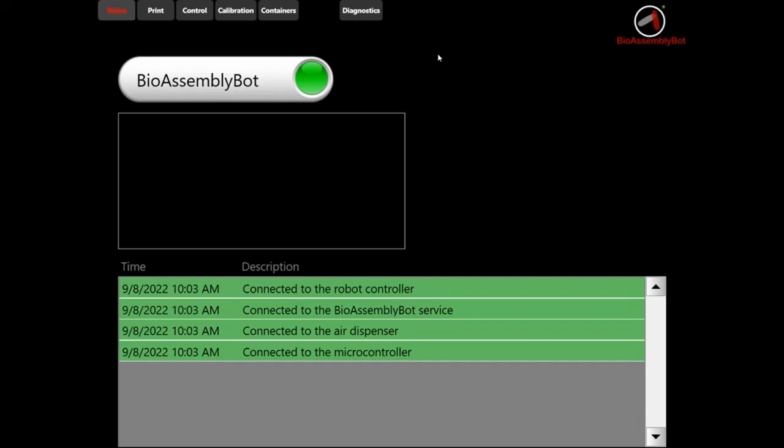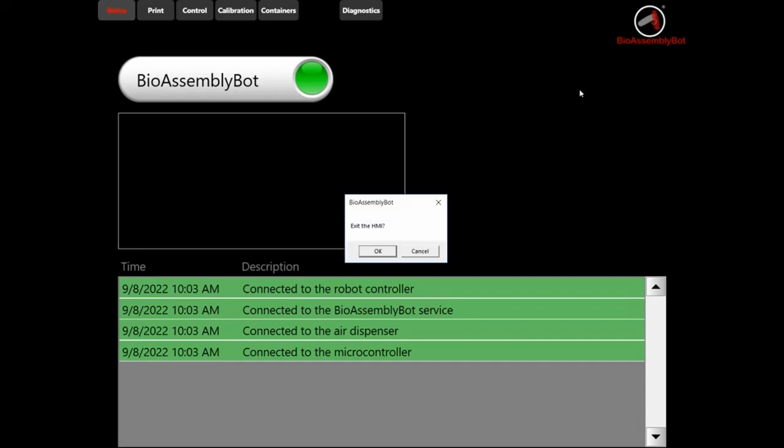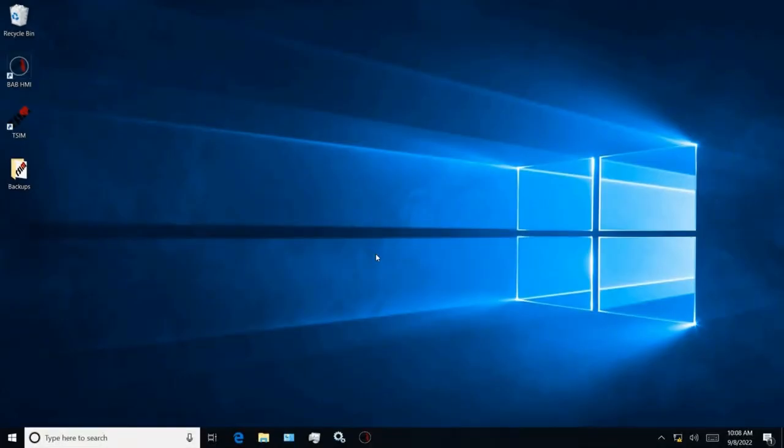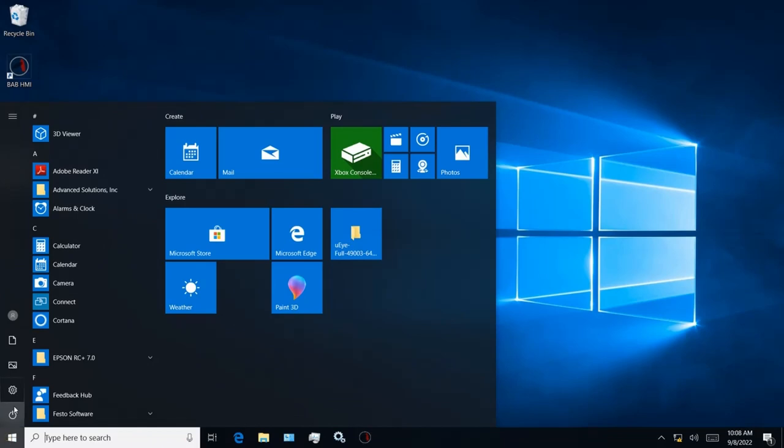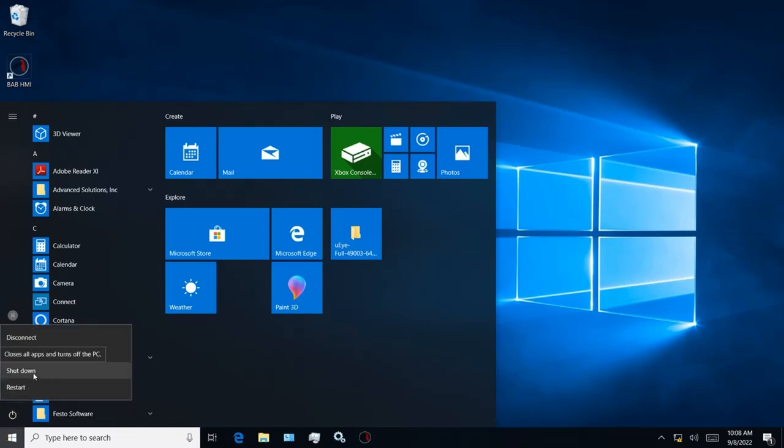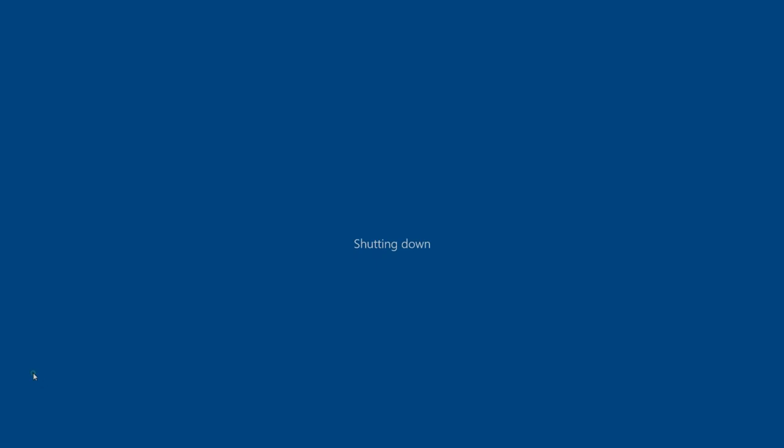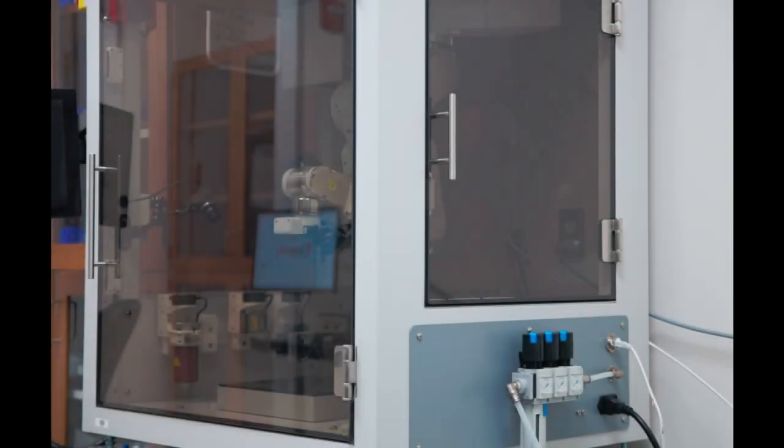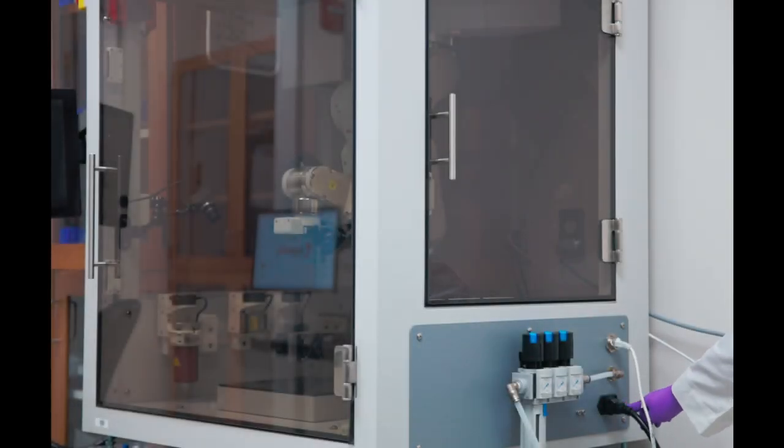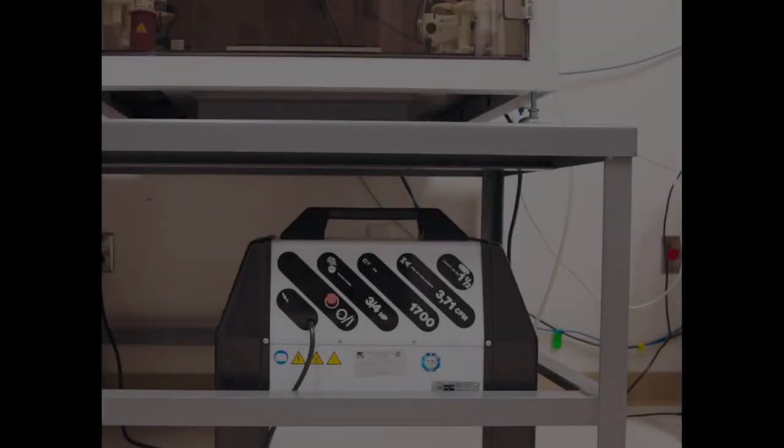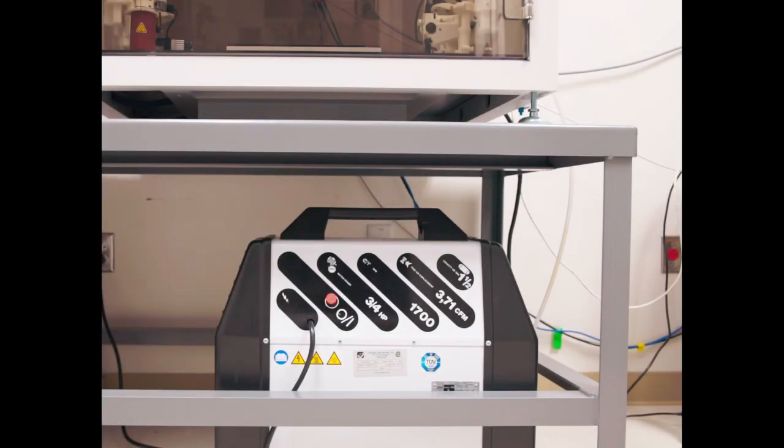Click on the bioassembly bot symbol here to exit the HMI application. Click OK. Click Start and power off the computer. Now, power off the bioassembly bot by pressing the power switch on the side. Power off the air compressor by pushing the red knob.